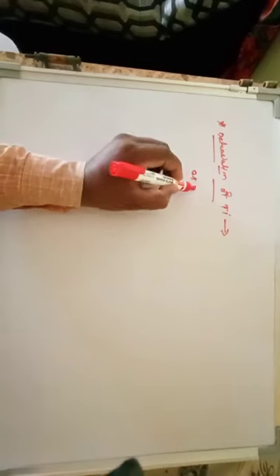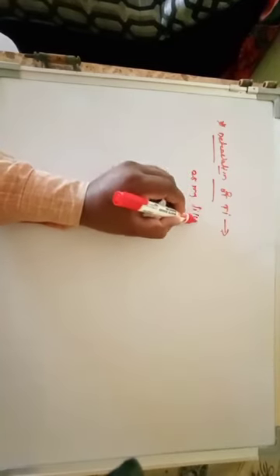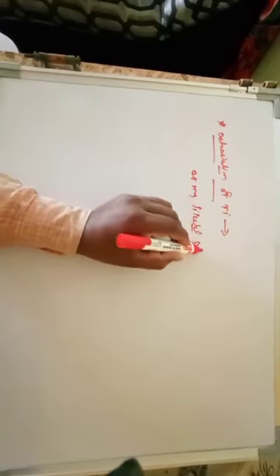So how will you find out the percentage or amount of titanium from the diluted solution? You have to take 25 ml of the first diluted solution, the mixture of both Fe and titanium.